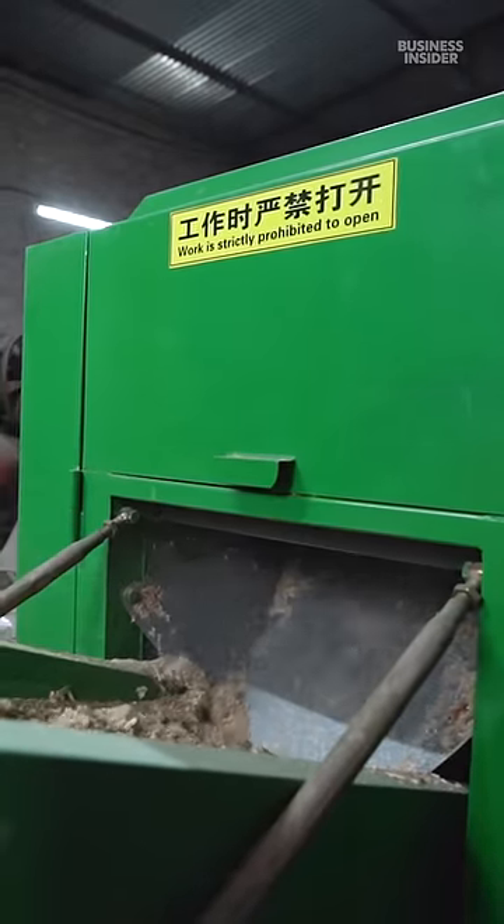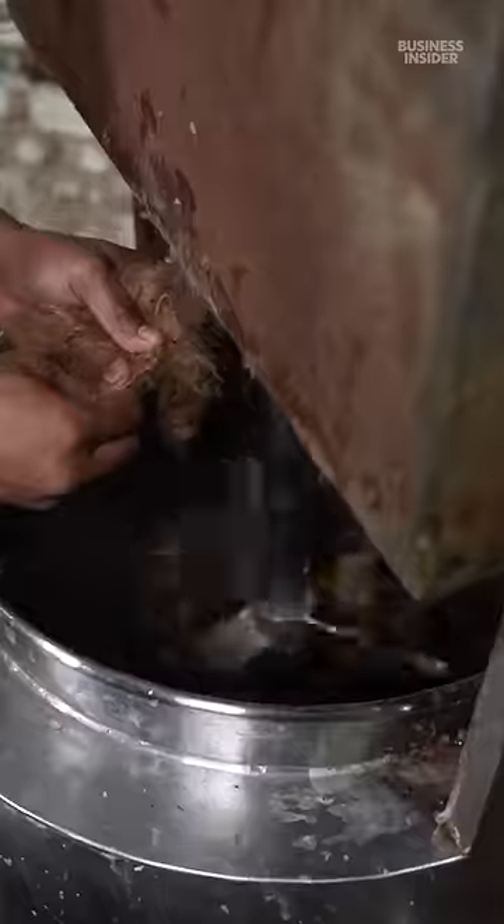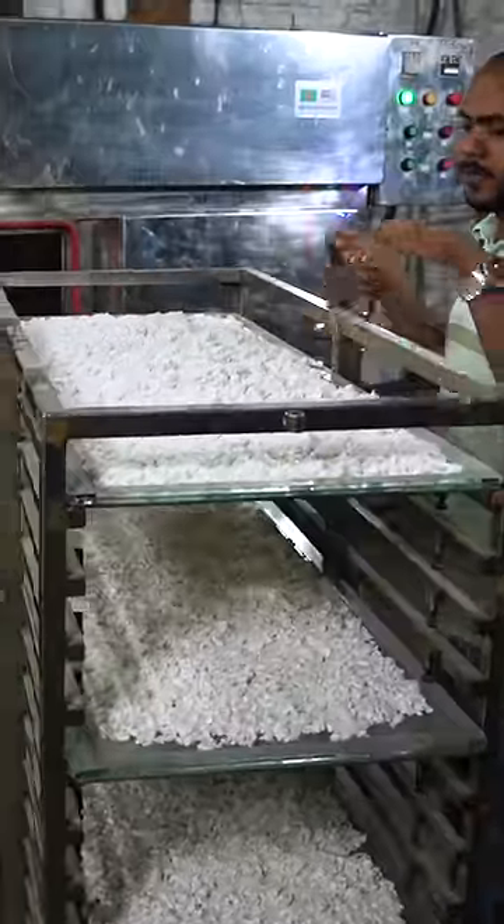First, raw jute fibers are shredded into 4-millimeter-sized bits. Then, they're mixed with some secret chemicals to extract the cellulose for about 4 hours. The leftover pieces are bleached and dried in an oven.